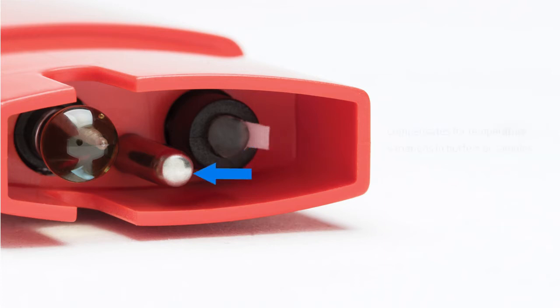The exposed temperature probe of the pHeps provides for a rapid temperature measurement in order to compensate for any temperature variations in the calibration buffers or samples being measured. This is absolutely necessary to achieve a high accuracy reading, especially with samples at the extremes of temperature and pH.